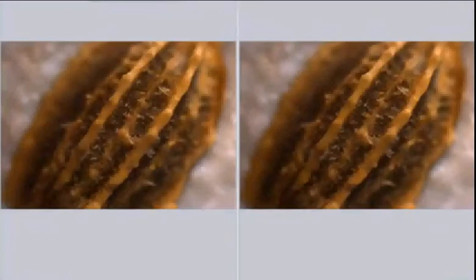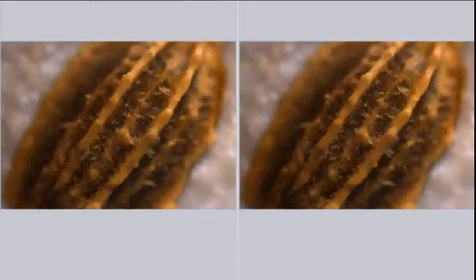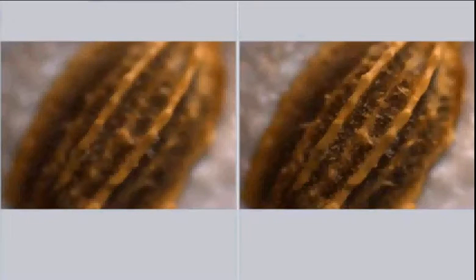I first start up the Live EDF. Notice on the left, I'm going to focus the microscope rather early. You can see on the left, the image is still live. On the right is the EDF image.